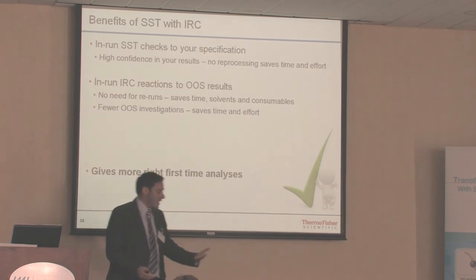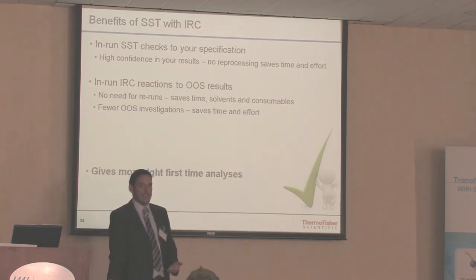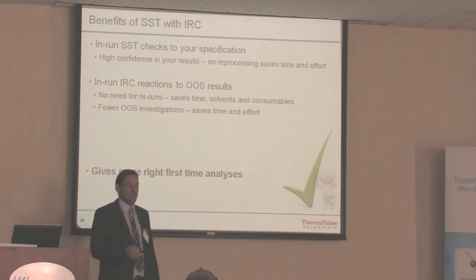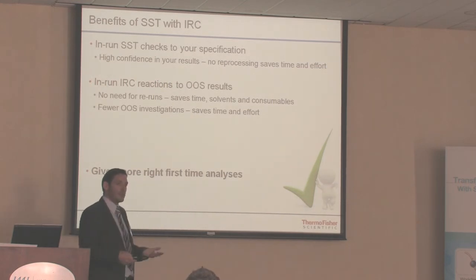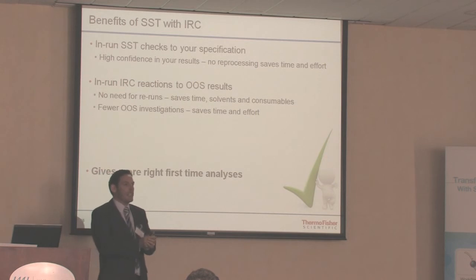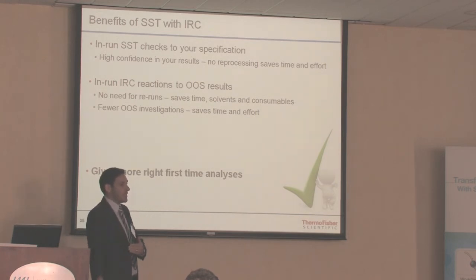I see people all the time, they get the results, they look at them, they put them into Excel, and then they check the SDs, and it's outside spec. You don't want any of that, so you want to do it. It does require a little bit of work up front, but then it does everything. If you want to set up the limits, as we discussed earlier, this isn't something you can just go there and just do. You always face problems. But putting the effort in up front, getting the analysis right first time, is much better.